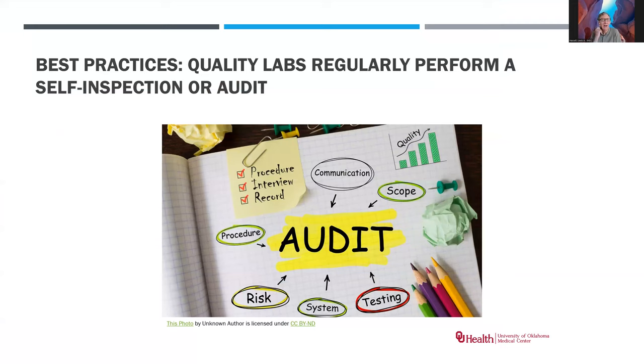Quality laboratories regularly perform some measure of self-inspection, and that's looking at everything you're doing, your procedures, your communication, your testing systems, your instrumentation, your personnel files and all these other sorts of things to identify where there may be problems, where there may be gaps, where you have issues that may not have been addressed.